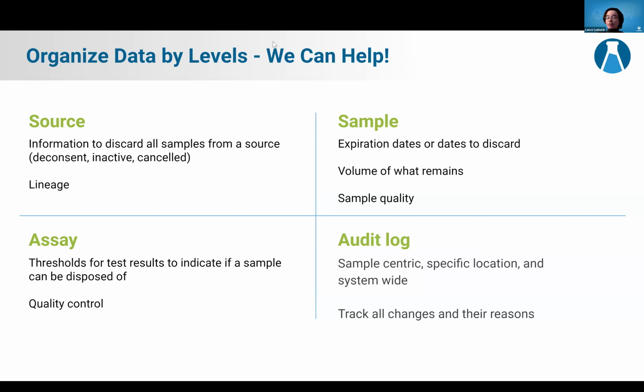And then, of course, in one of our most recent updates in Sample Manager, we can enforce specific reasons for certain events. So when someone is discarding a sample, they will have to type in a reason for why they're getting rid of something. So if an auditor comes in and asks why you disposed of these samples, we have that reason right there.